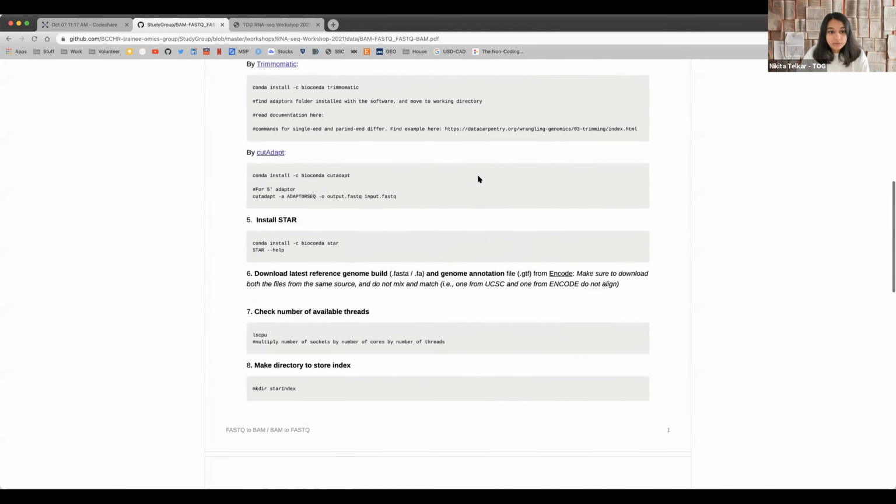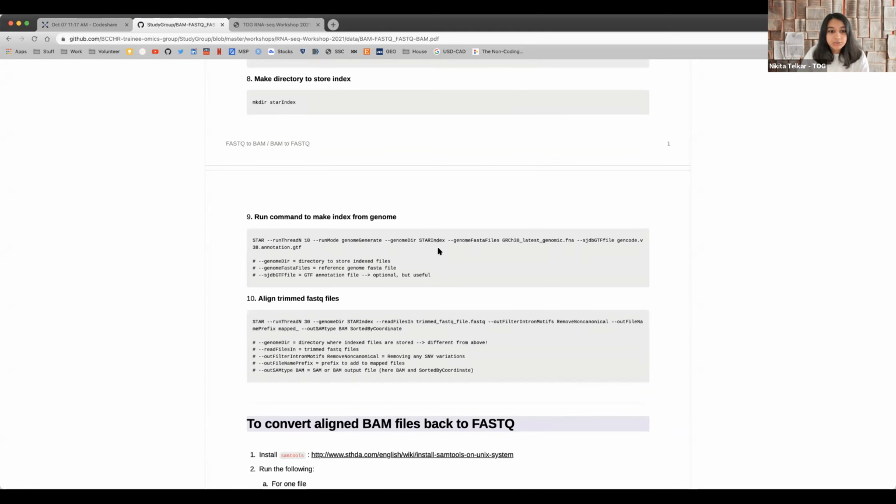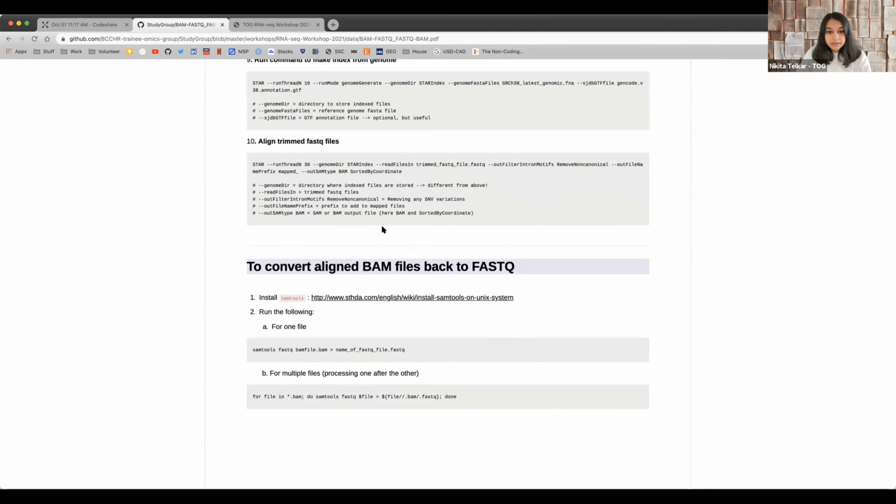If you go through these steps, which takes a little bit of time, I've tried to annotate this as much as possible and show exactly which flag means what. That's basically how you would convert your FASTQ file to your BAM file. And you have to do that for each of your samples. Each sample will have a separate FASTQ file.